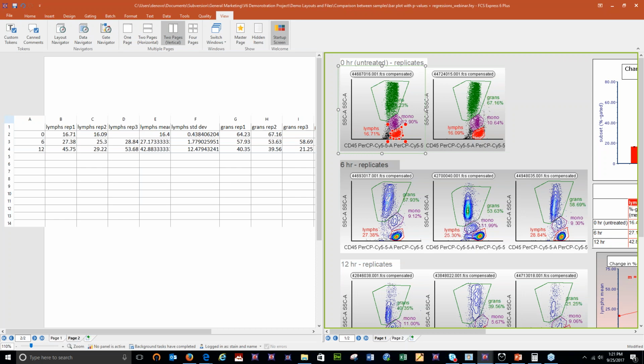Sometimes those programs have very specific formats about the conformation of the data. And so that can be really tedious, right? Because in reality, your samples are going to change from day to day, and you probably do have to move the gates around. Or maybe you're doing a different kind of assay with a different cell line, then of course your gates are going to change. And so why recreate the wheel every time you do a variation on what you've already done? So this is all changing in real time.